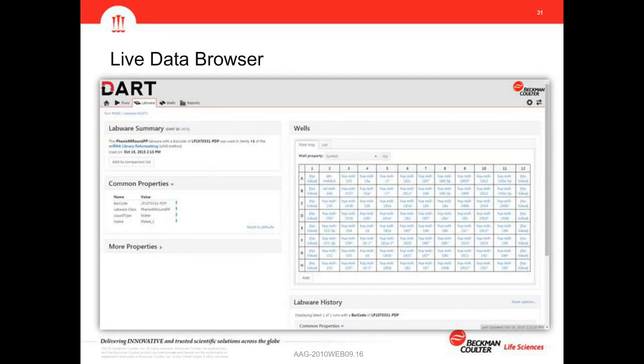So the other view of this is through the web. This is an example from a laptop computer that could be viewing this from another room. In the case of Mike's system, it's tucked away in an applications lab and in a clean room, and so he gowns up to go in there. So if he'd like to take a look at how things are going, he could use this from his desk out in cubicle land and be able to drill down into it.